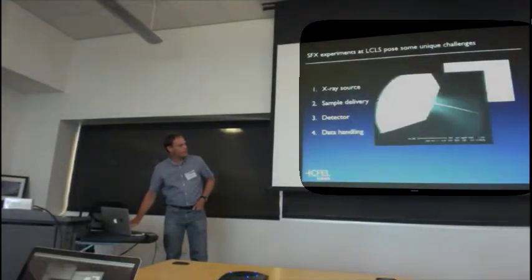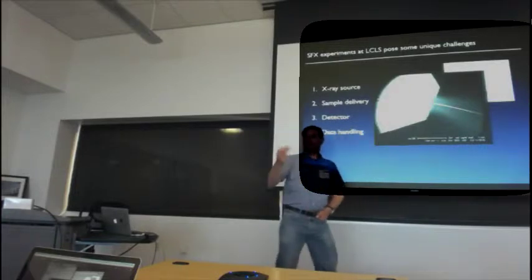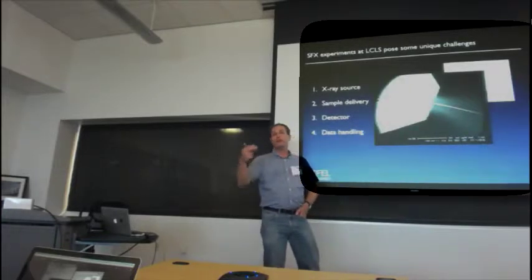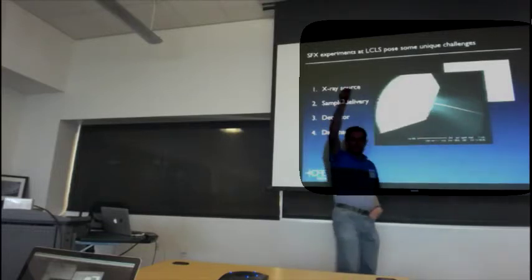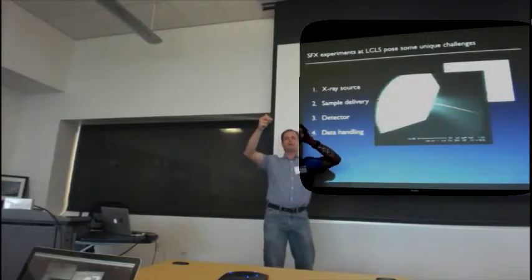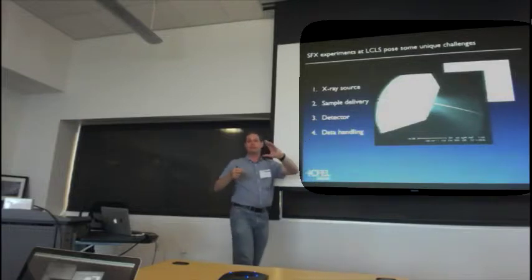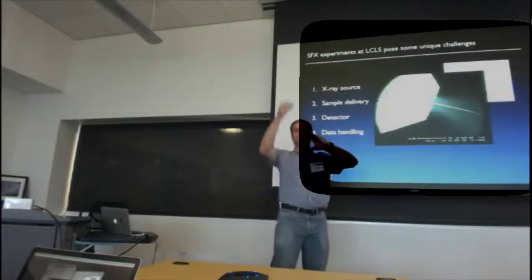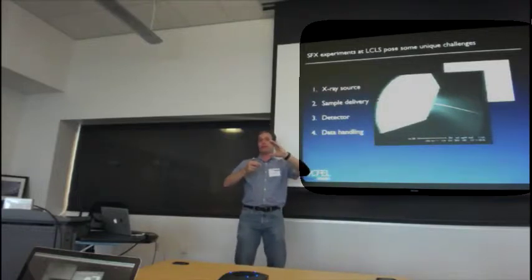There's the sample delivery, as has been talked about. This means that your crystals are in random orientation and that you have something like a hit rate. So this is not one long crystal just being dragged through the beam like a fibre. It's a suspension of crystals, and these crystals interact with something that's like an X-ray focus. And a lot of the time you might just get solution scattering. Depending on the concentration of your crystals, there might not actually be anything crystal diffraction-wise in there at all.